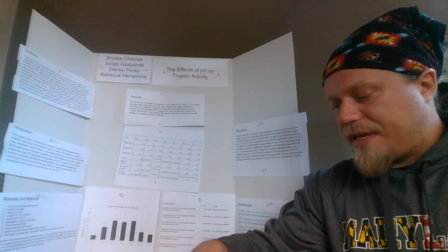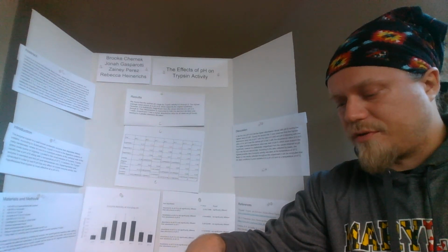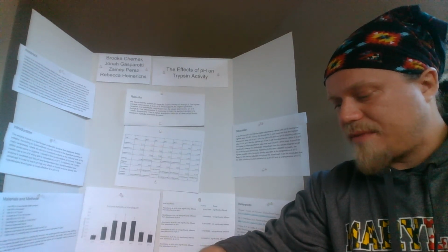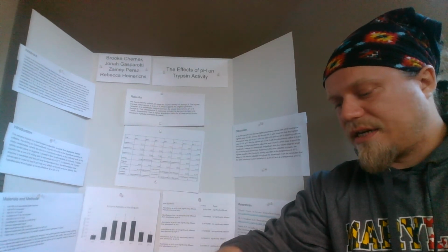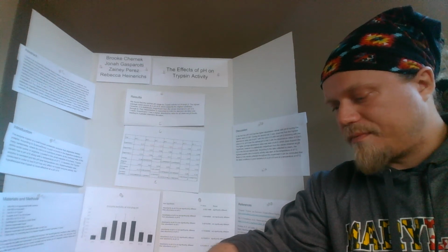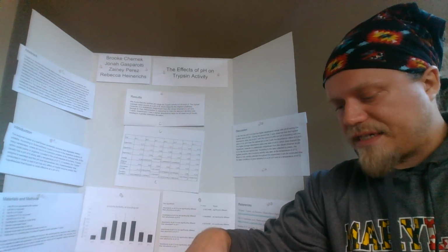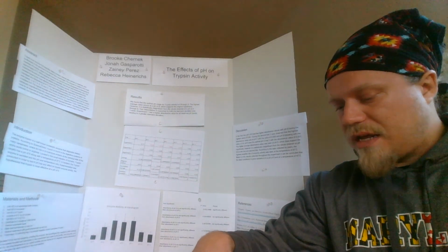Activity was monitored at pH 5 through 11 with 3 trials plus 1 native control with no trypsin. Control variables are incubation time and temperature, 47 degrees for 20 minutes, and a salinity of 0.15 molar. These were both chosen for maximum activity. The substrate is azocasein, a milk protein.